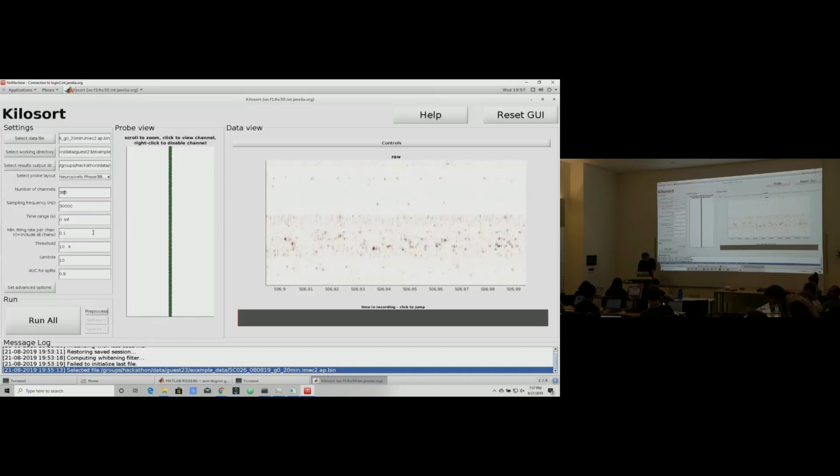Well, so assuming you can all change it to 385, as soon as you do that, you know the data on the right should now look correct. I mean, you'll see that it looks better if you zoom in more. So to zoom in, press Shift and zoom in. Now, I have a mouse, so it's easy for me.